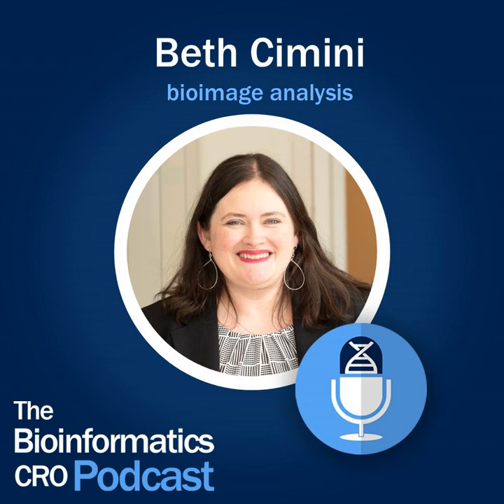And when you're a bioimage analyst, you're presented with an image and you're sort of told, find the interesting biology here. And so there's a couple different pain points, one of which just being how can you find the objects of interest in the first place, which feels like it should be simple, but some of that's because we have very good onboard neural networks, let's call them, that help us find the boundaries of things, because otherwise we'd run into stuff all the time.